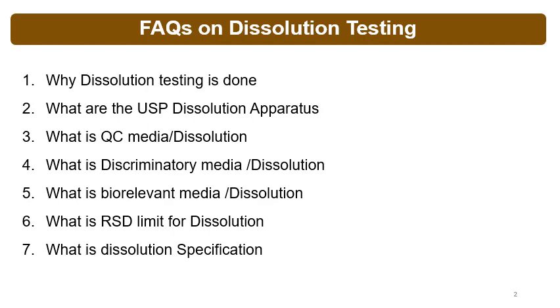For biorelevant dissolution, the media is made in line with the in vivo conditions, the in vivo gastric media and the intestinal media. Nowadays, ready to use biorelevant medias are available, and these are used for biorelevant media and biorelevant dissolution.